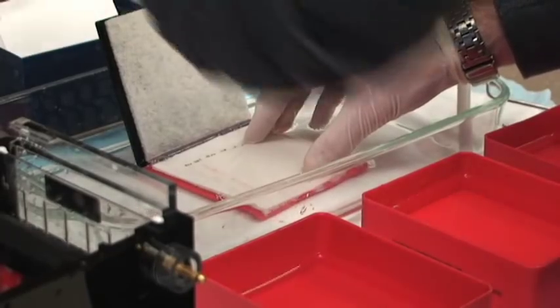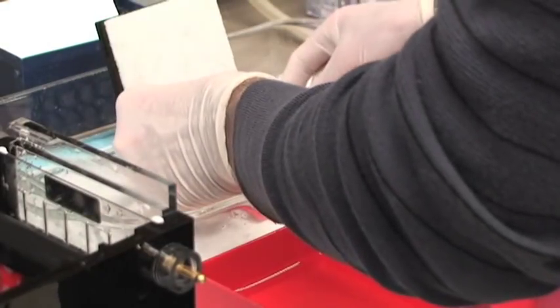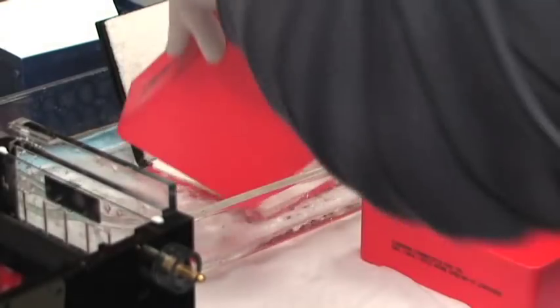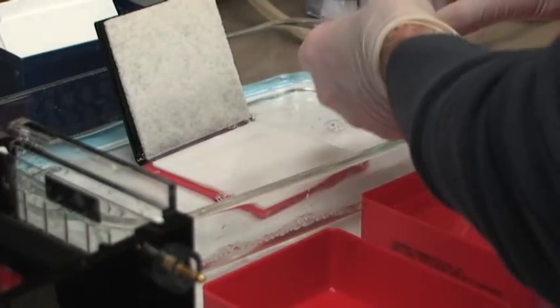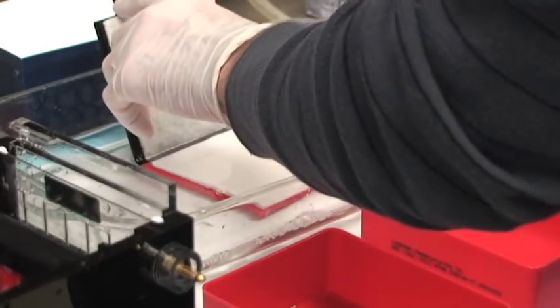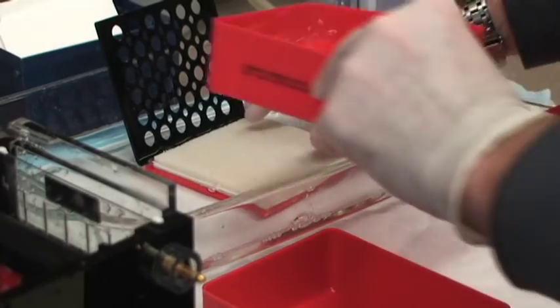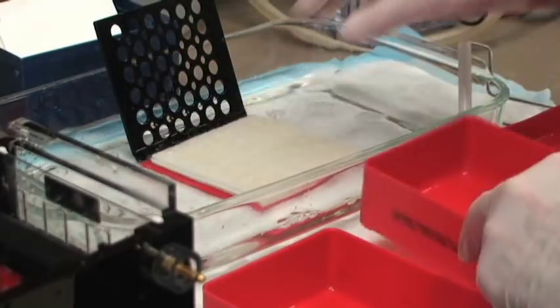Larry, can you estimate how many Western blots you've done in your PhD? It's almost experiment 300, and that only counts Western experiments for the most part. So probably close to 1,000 to 1,500. That's the day-to-day.